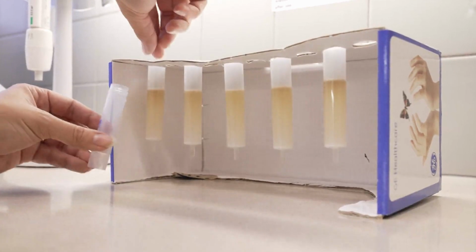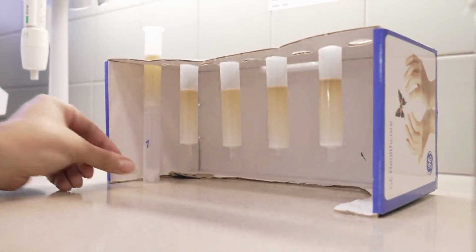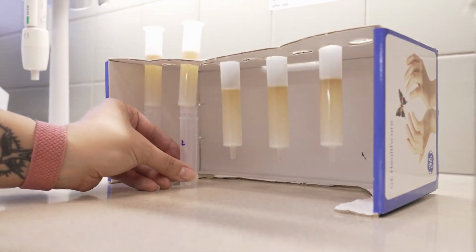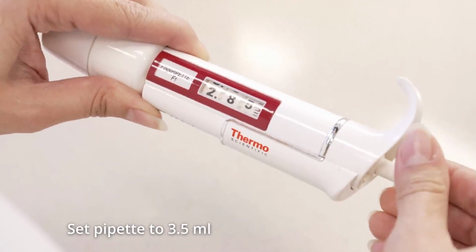When columns stop dripping, test tubes for sample collection are placed under the columns and 3.5 milliliters of water is added to the columns to push out the desalinated sample solution into the test tubes.